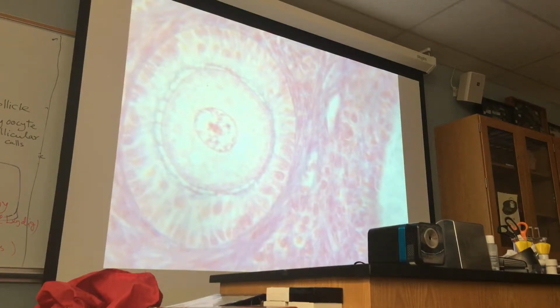So here, the cells. What is the name of the cell? Primary oocyte. What is the name of the cell? Granulosa cells. Granulosa cell. Very good. And here, what is this structure? Theca folliculi. I don't know if it is there. Theca folliculi is there in the study guide. If it is not there, I may ask that in bonus. What is that? Theca folliculi.